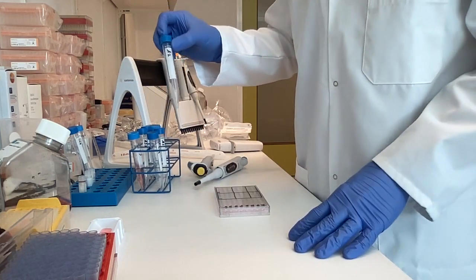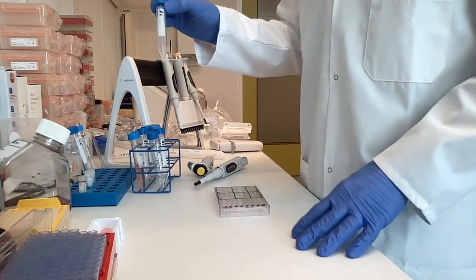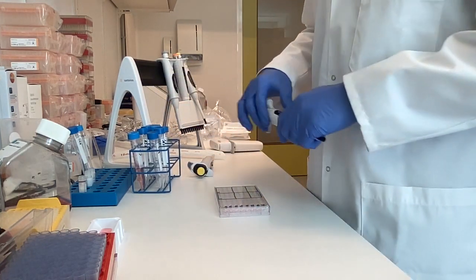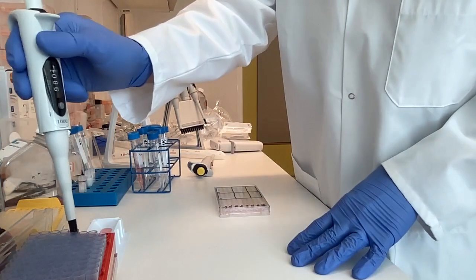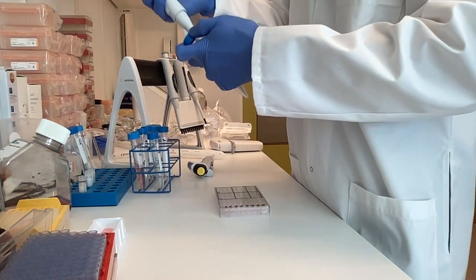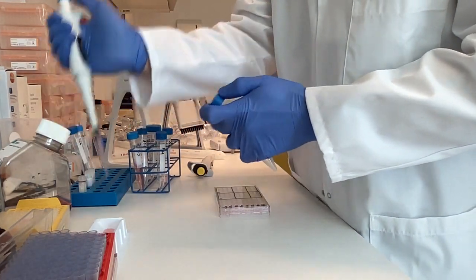In this case we're going to do the same for sample 2. If you're using a different test with a different maximum validated dose dilution, it will be different, but in this case we'll just use the same dilutions, so 1 to 50 for the highest concentrations. So for that I'm going to take 980 microliters of RPMI and add it in the tube A1 for product 1 and A2 for product 2.